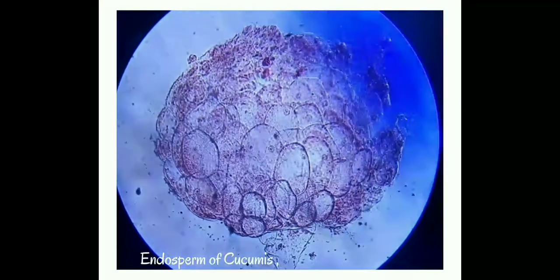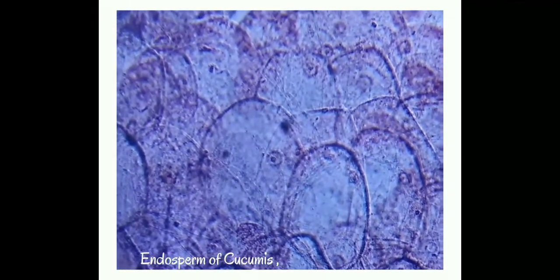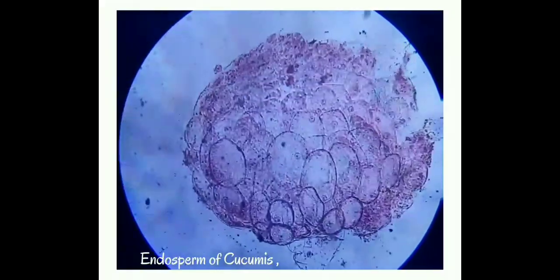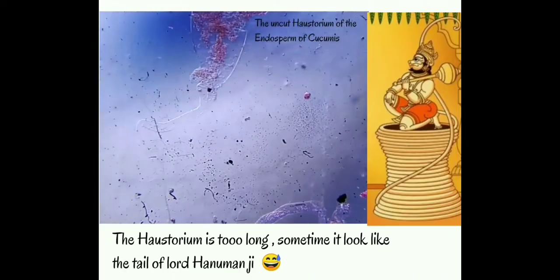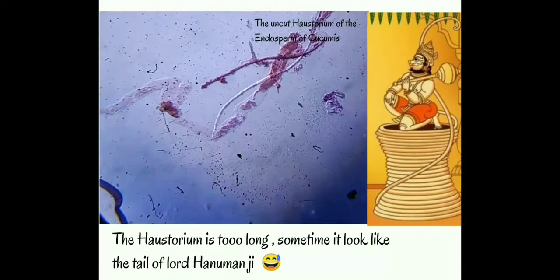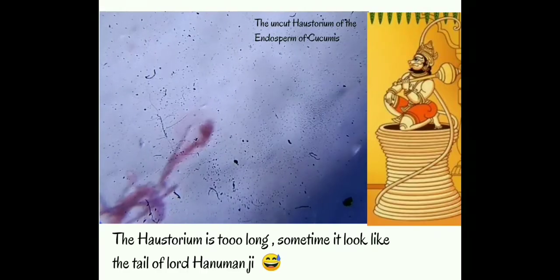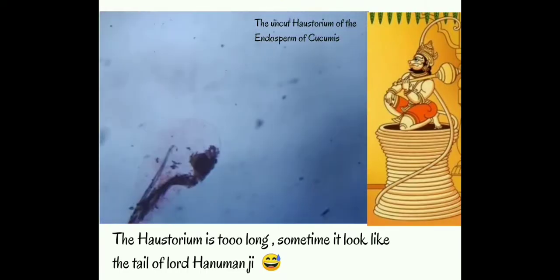This is the endosperm of cucumis. You can clearly see the nucleus of the endosperm, which is triploid in nature. The haustorium is very long — sometimes it looks like the tail of Hanuman. You can see the tip of the haustorium, which is bulged.